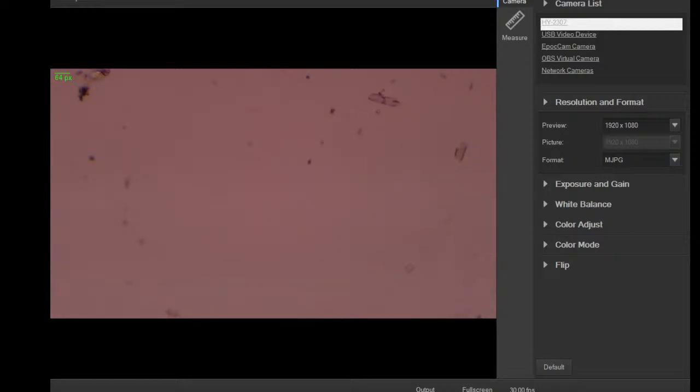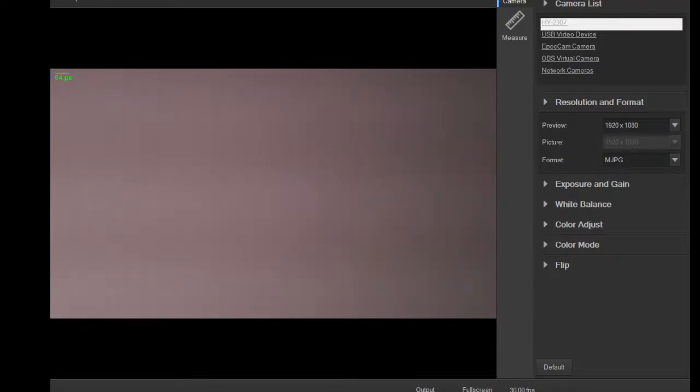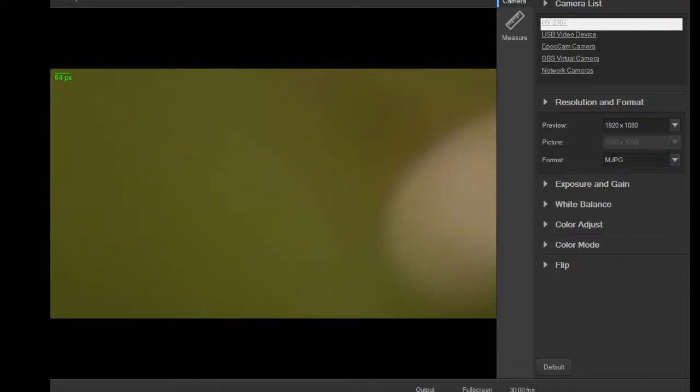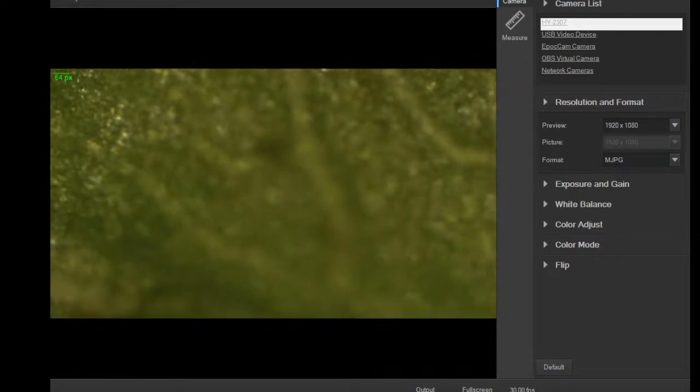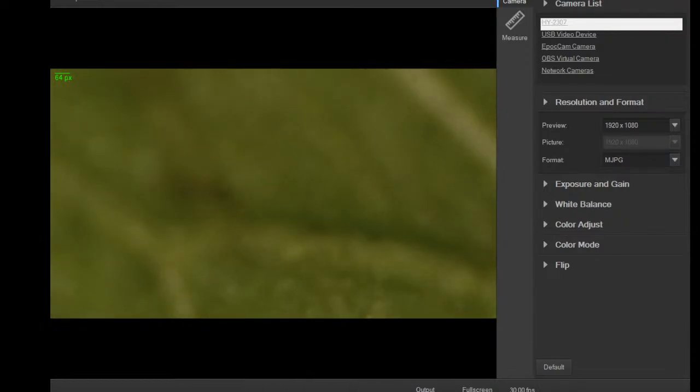But it's thin enough, and it is alive, so I might be able to get some interesting view of it here. I'm going to try a dry mount first, and if that doesn't work, I'm going to do a wet mount and smash it a little bit. But since it is alive, I didn't want to totally screw it up, because if I get a good view, you might be able to see some more cell activity here. Oh, there's a little cut there. It's damaged.